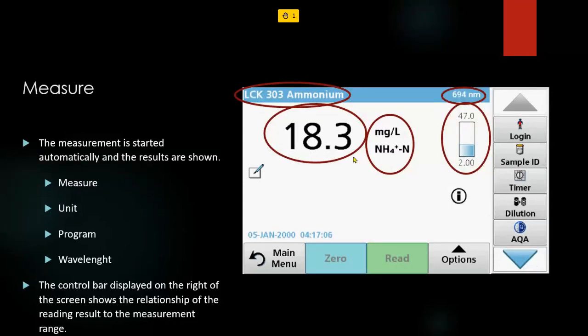The ammonia and the nitrate are inside the liquid part of the sample. They are not inside the particulate. So if you take out the particulate from the sample, you will not lose them. The removal of particulate won't affect the result. Okay, got it, carry on.